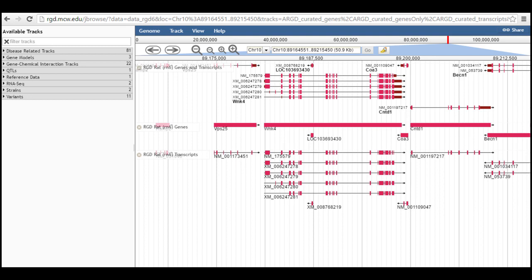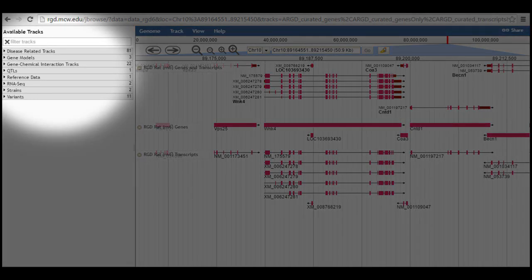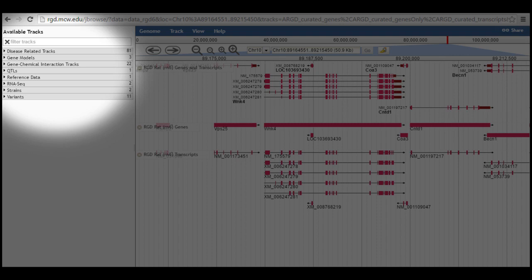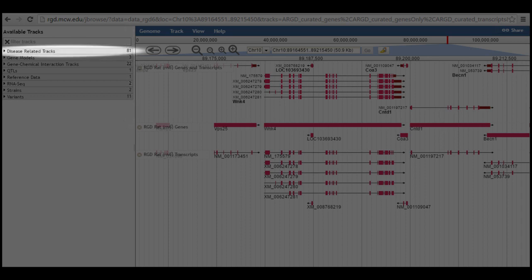Tracks in the browser display can be turned on or off using the available tracks menu on the left-hand side of the page. Here, you can see the list of categories for which tracks are available. The number to the right of the category title gives you the number of individual tracks available in that category, so there are 81 disease-related tracks, but only one track with reference data.